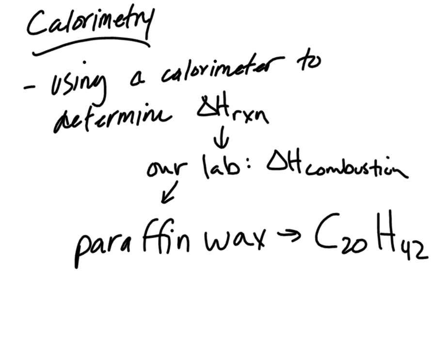All right, this video is on calorimetry. It is the pre-lab for your candle burning lab tomorrow. So what you're going to be doing is using calorimetry. Now, calorimetry is the process of using a calorimeter, which is a device. It can be built in many different ways to determine the heat of a reaction.